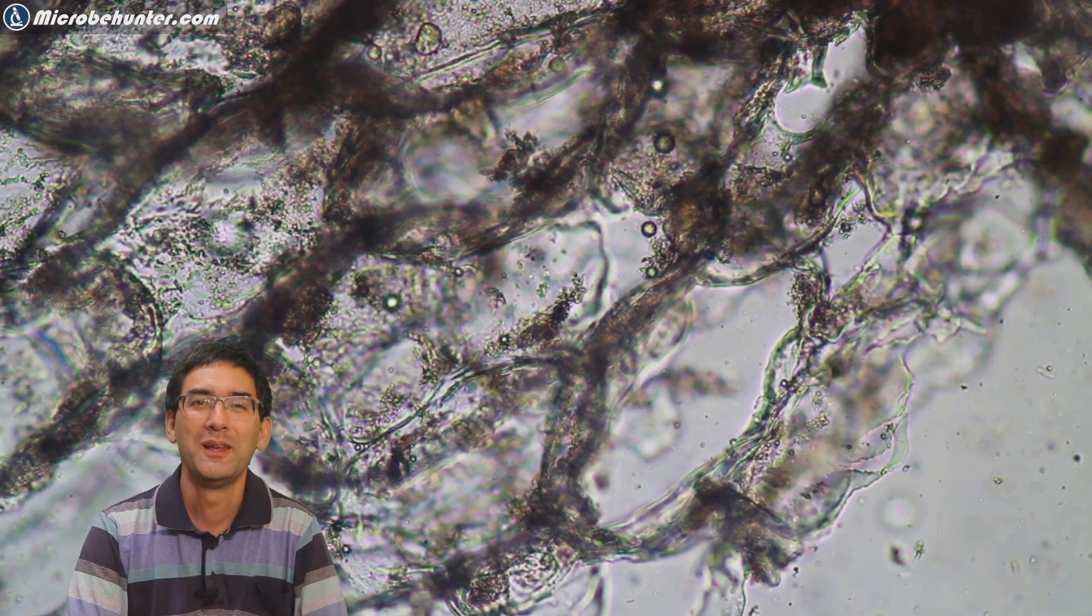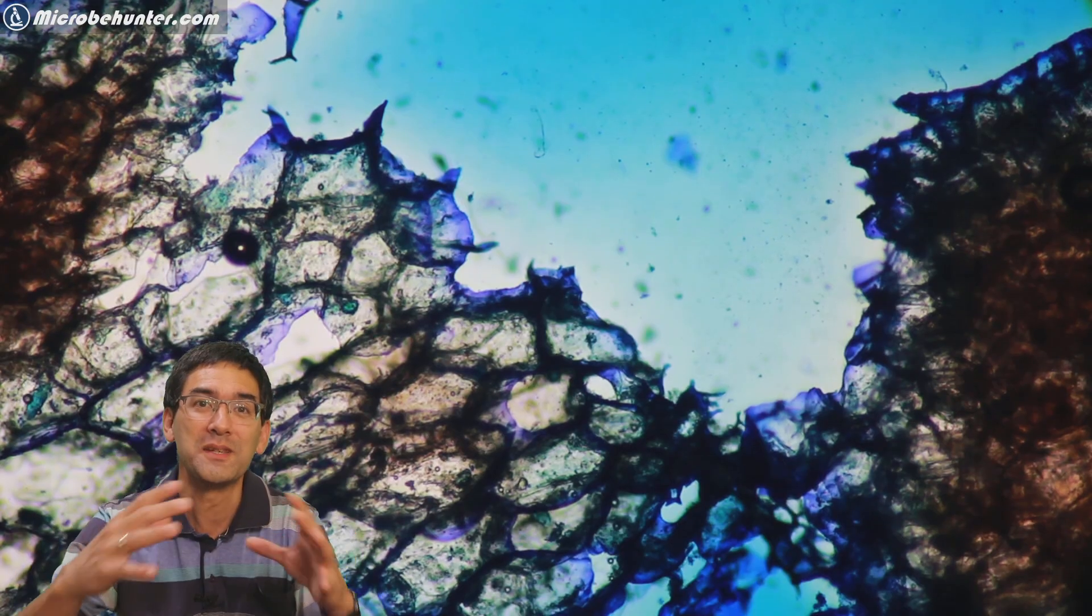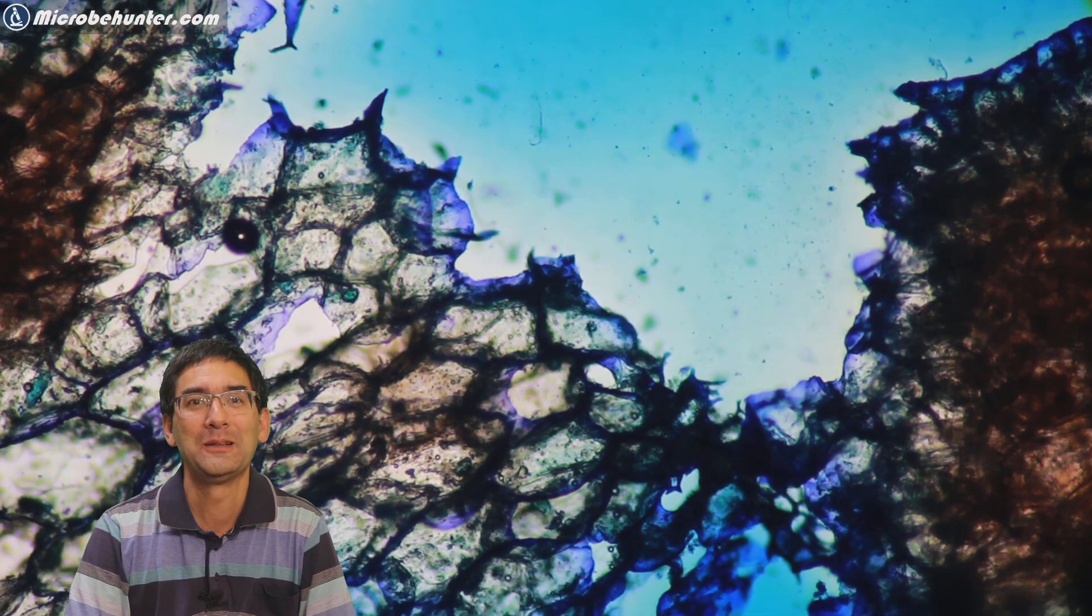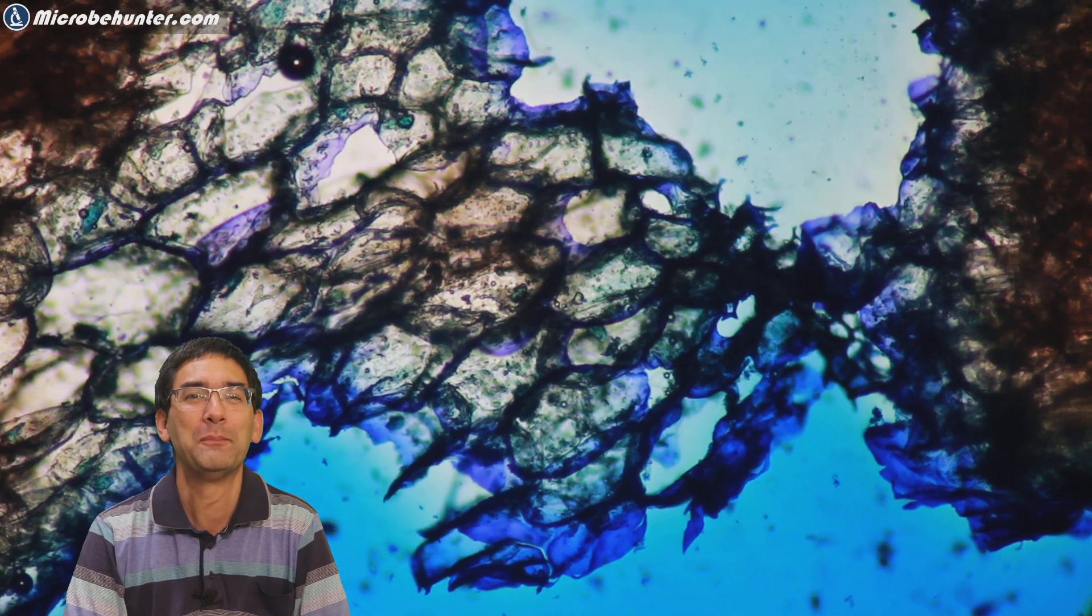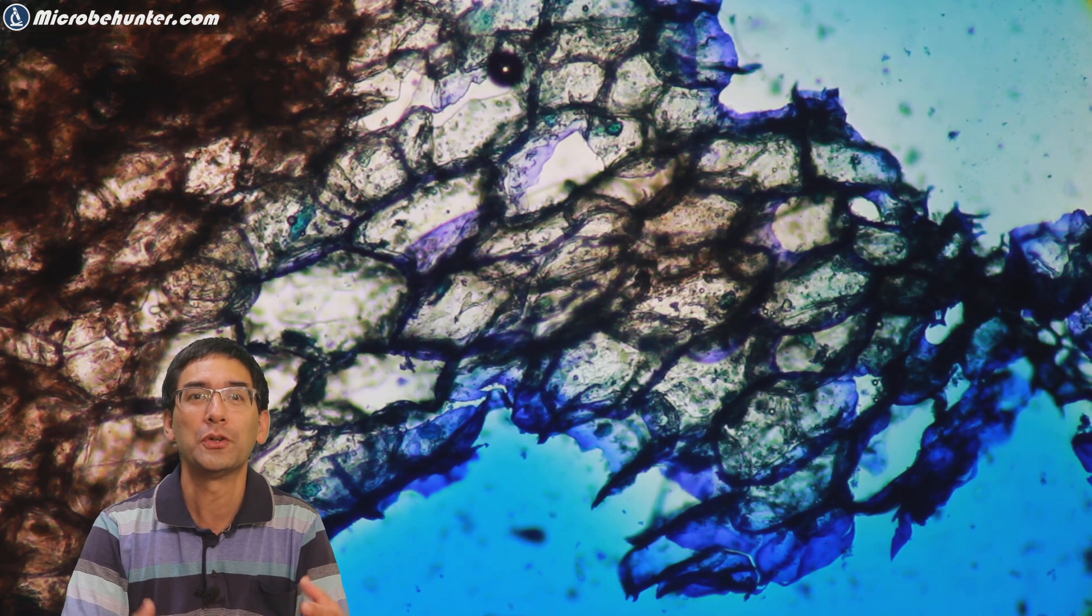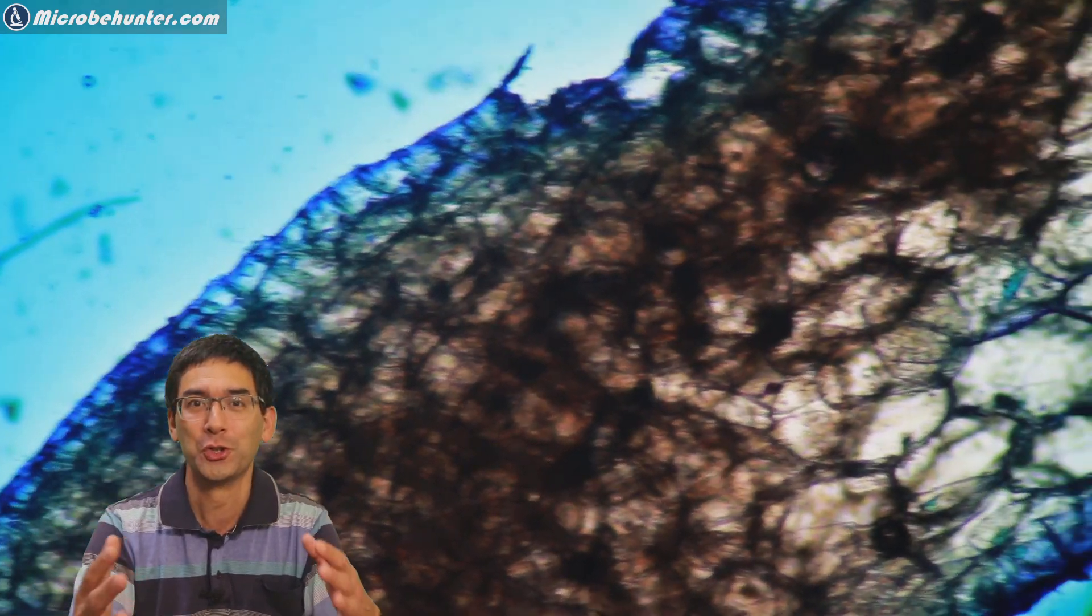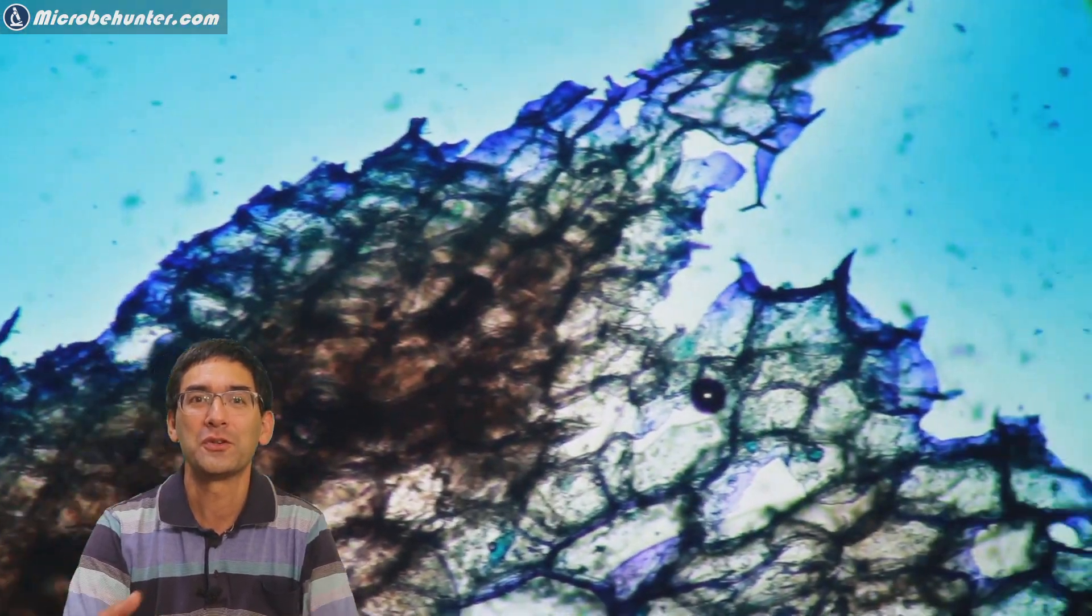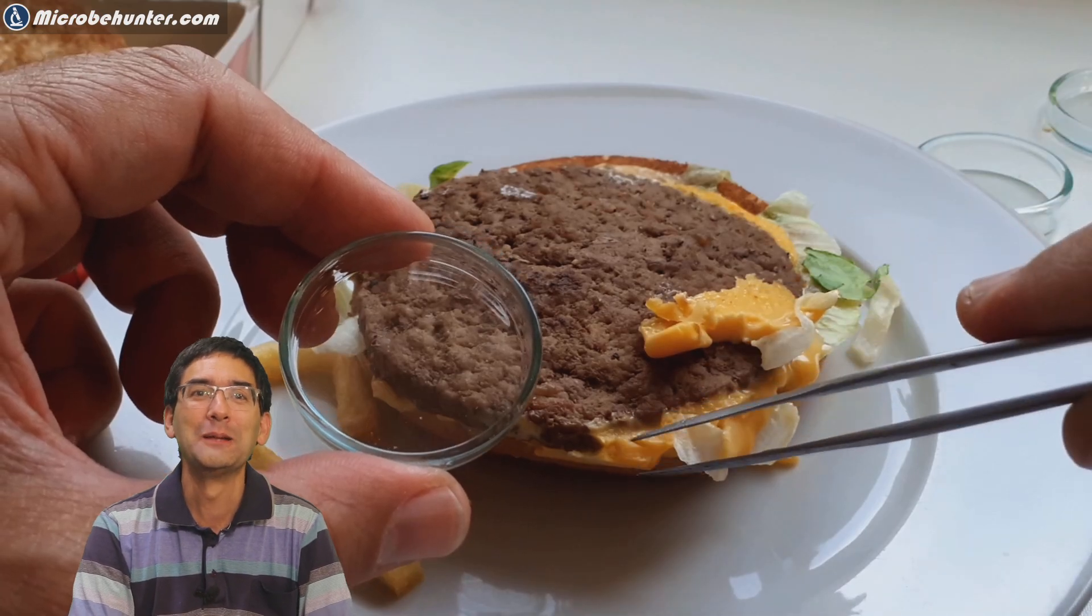Here again you see the methylene blue starts to stain the cell walls - looks quite nice. Under the microscope there's not much left of the hamburger, doesn't look like a hamburger at all, but still fascinating how many natural products you're still able to find in food. Food is, after all, a natural product or should be, and all the vegetables are fresh plant materials and therefore an interesting source to do a little bit of biology.